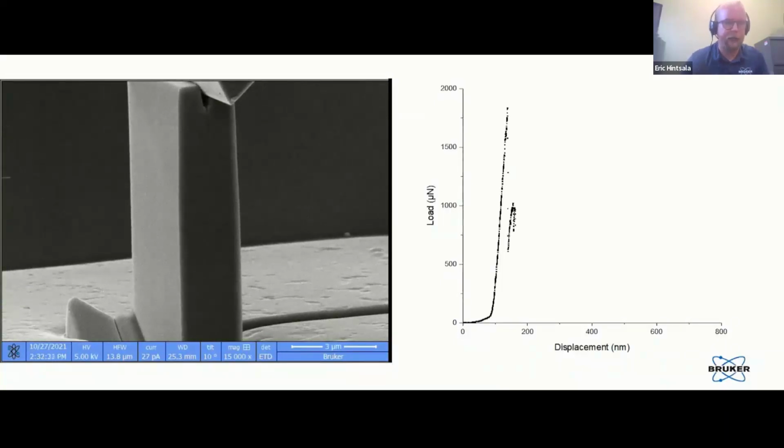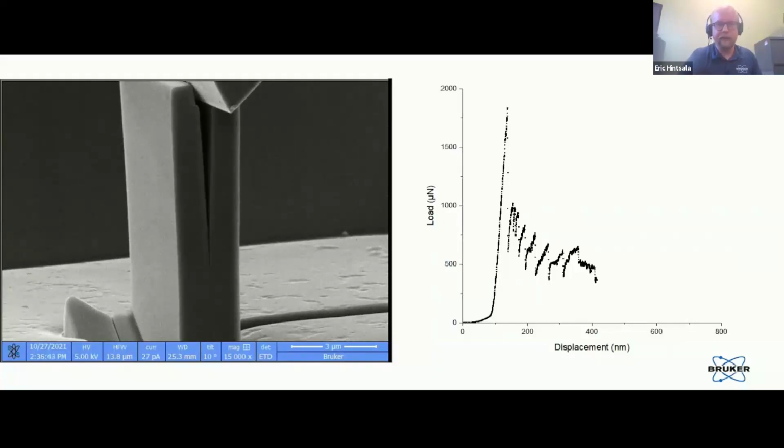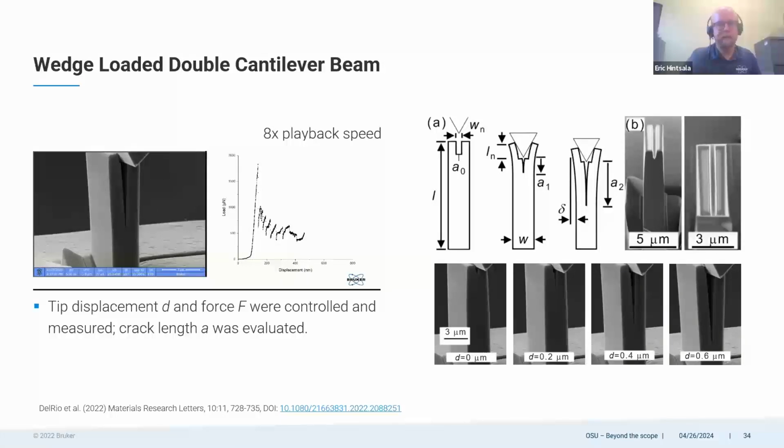And you can see the crack nucleate out of the notch. And then as we continue loading it, we keep getting load drops one after the other. In each one of these load drops, you'll see the crack grow by a pretty well-defined increment on the SEM video correlated to it. This is a nice experiment because what you need to do fracture toughness is get the mechanical energy going in and relate that to an amount of crack growth that you're getting in the sample. So here we're just testing silicon. This is a base material to benchmark the technique, and then the idea is to move on to some more interesting test cases in the future.